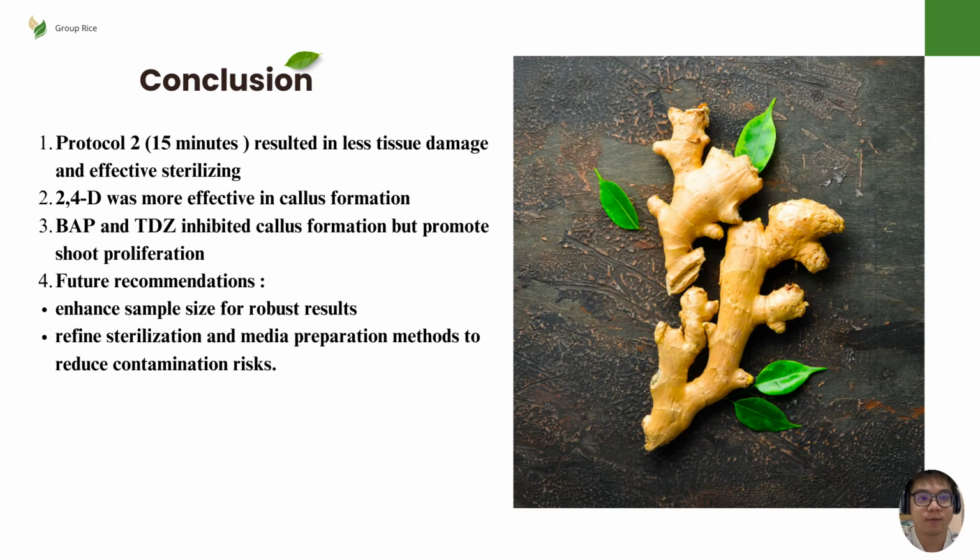In conclusion, we have successfully demonstrated that a shorter Clorox exposure time, which is 15 minutes, minimizes tissue damage while effectively sterilizing explants. 2,4-D media was able to promote callus induction. However, BAP and TDZ media were able to inhibit callus formation but promote shoot proliferation. However, challenges such as endogenous contamination and small sample size limit the consistency of these findings. Further optimization and validation of sterilization protocols and media composition could enhance the efficiency of micropropagation for large-scale applications.